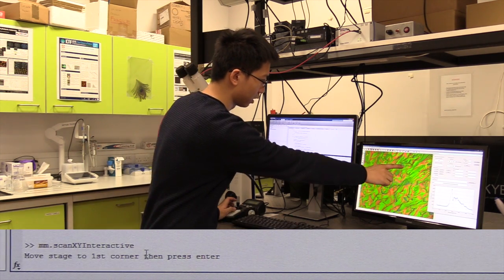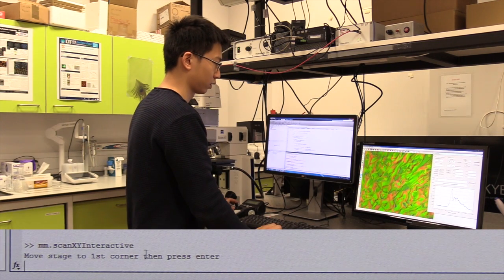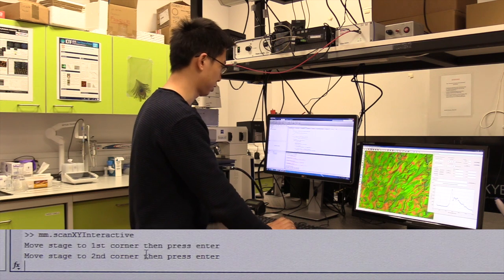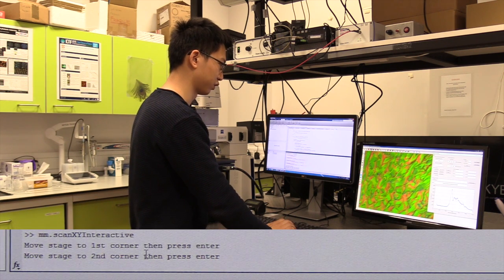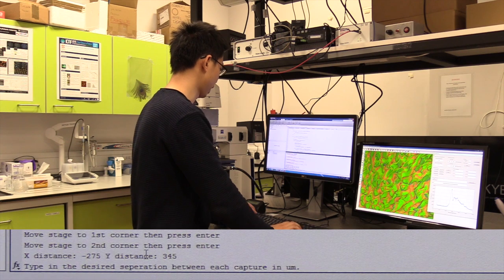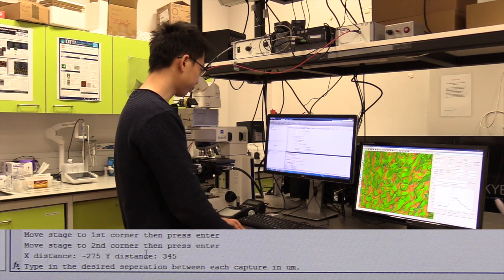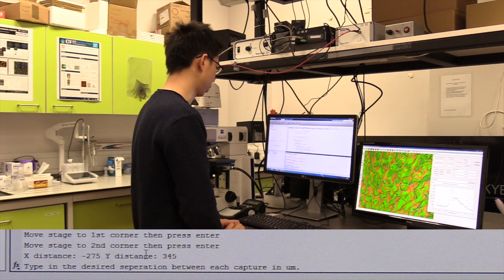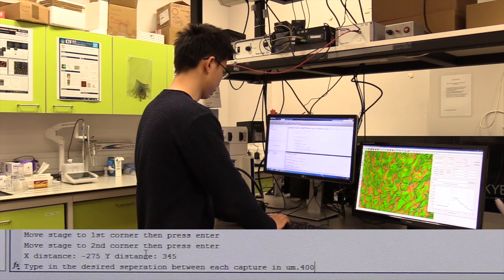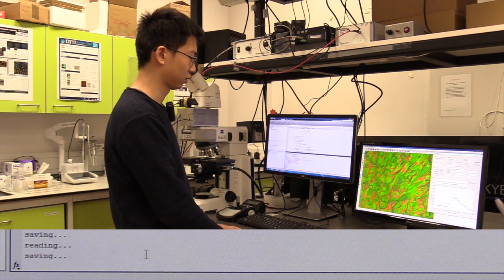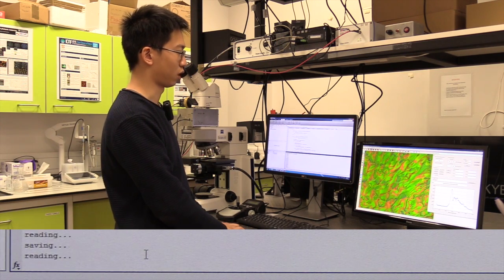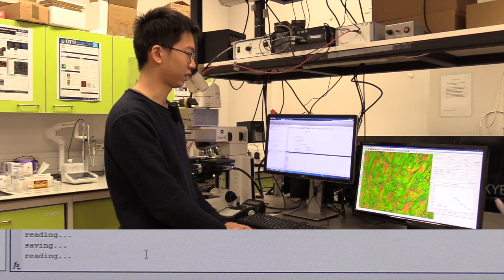What I will do is I will move to the first corner, press enter, and move to the second corner, press enter again, and type in the separations I want. I'd like to have, for example, 40. As you can see now, the stage will move to each point to be scanned.